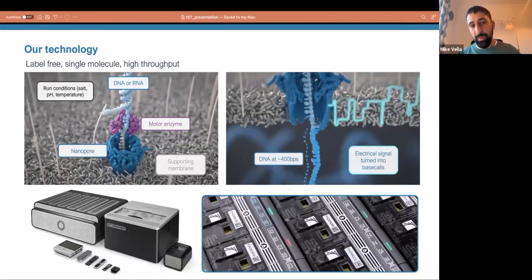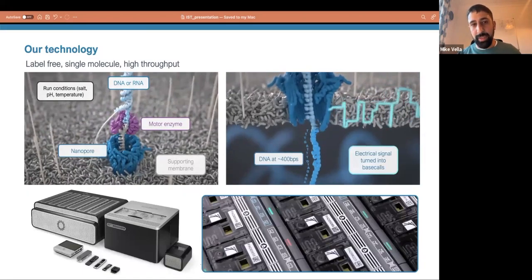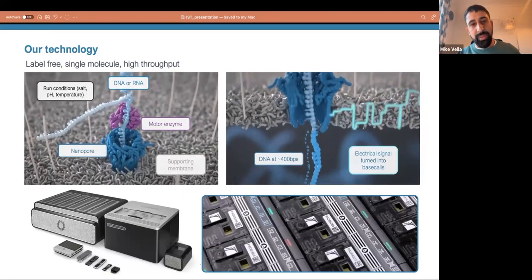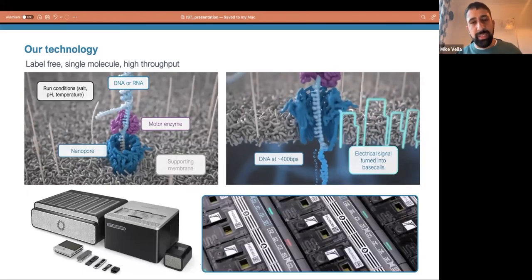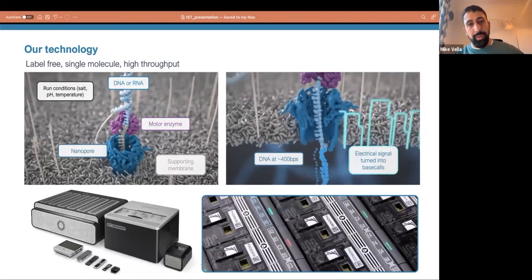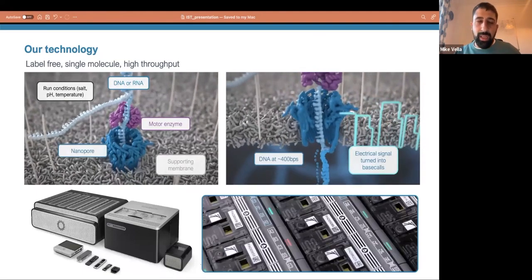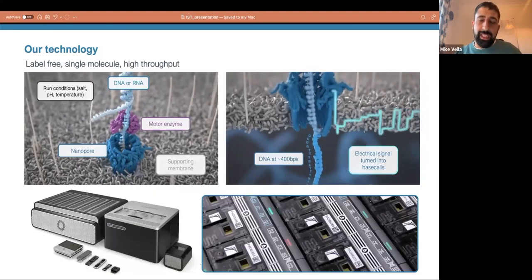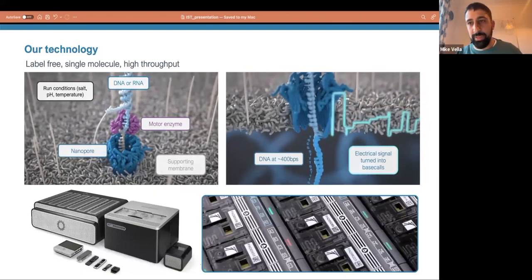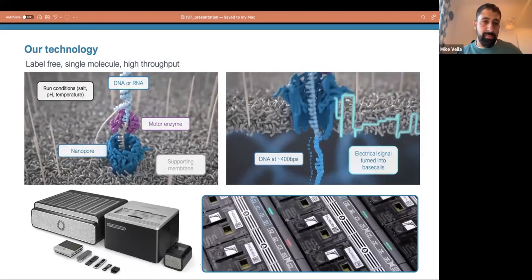They incorporate fluorescent nucleotides into the chain of DNA that's being synthesized, and using very sophisticated cameras and advanced microscopy, they can infer what the DNA is via this replication process. It's rather clever. Essentially it's hacking the DNA replication process to understand the underlying sequence of DNA.